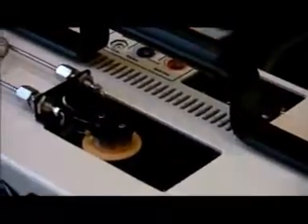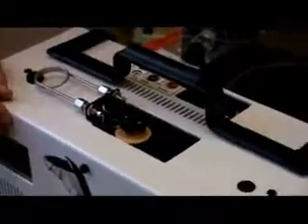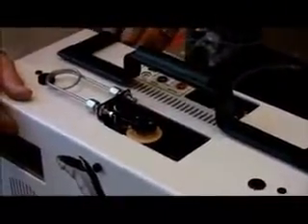And you see possibly 4 mounting screws. This is where we would mount either a rotary or a diaphragm plunger style automated sample valve. Again, it's controlled by using this auxiliary port or in combination with the auxiliary port on the side to fully automate the sample introduction. And again, if you're using a syringe style auto injector, it connects and is programmed through the personal computer. And of course on the front there's a display, and we'll get into that in just a moment.